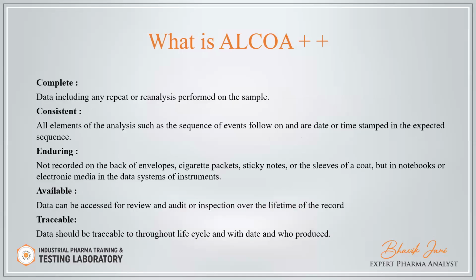Then the complete. Data should be complete. Means for any repeat analysis or re-analysis, all the data should be in one file. It's not like repeat analysis data goes with other incidents and re-analysis data with different types of incidents. It's not like that. All the data should be in one file.